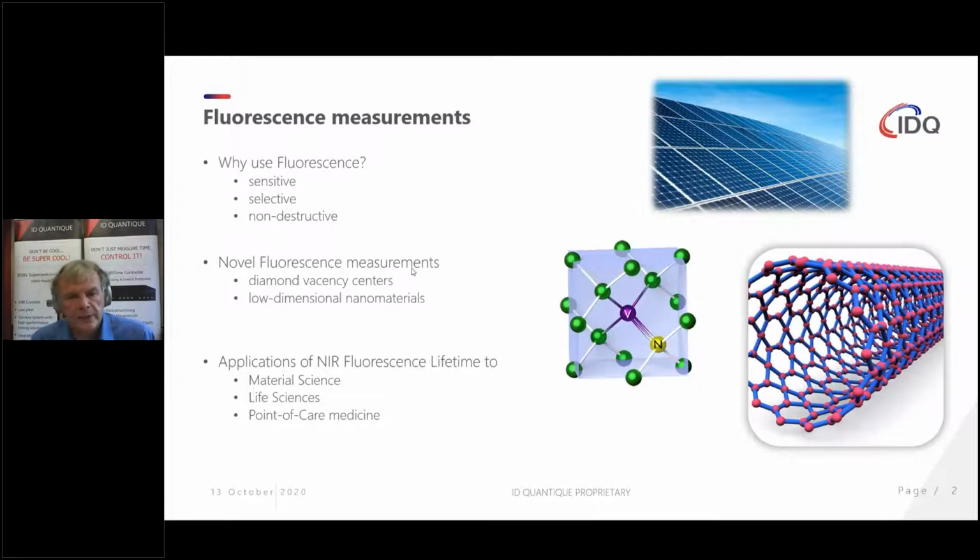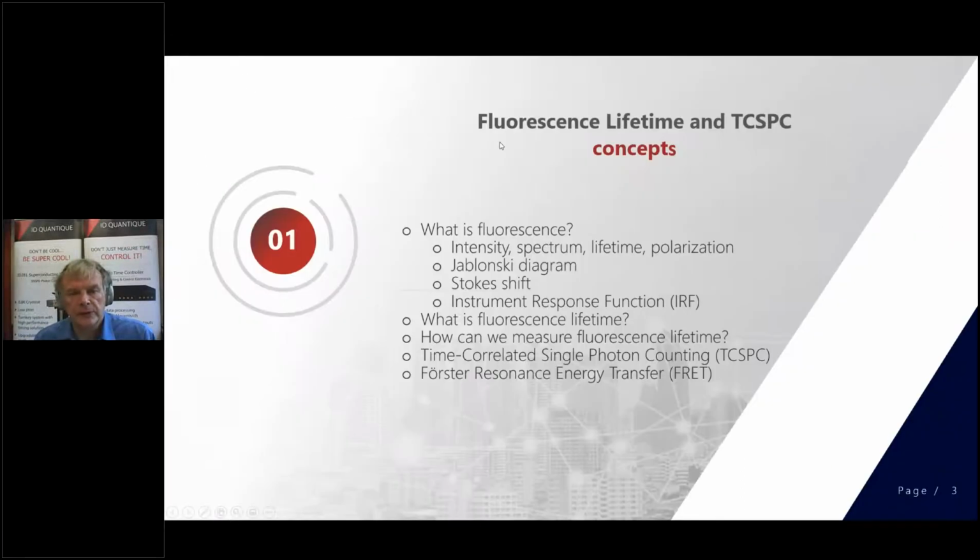And in the second part of my presentation, I will give some examples of how NIR fluorescence is used in material science, life science, and we hope that it can be used in point-of-care medicine. So if you go to the next slide, I'll give an overview of the concepts of TCSPC, including the intensity, spectrum, and lifetime.